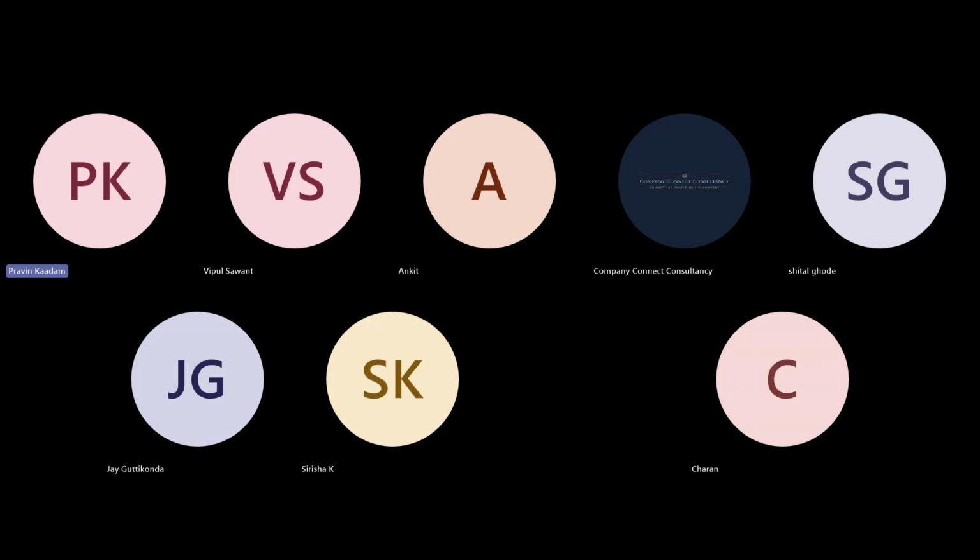Yes, very good question. If you have two different application servers, the exe path has to be the same. If it is E drive on the first server, it has to be E drive on the second server. All the prerequisites should be present on the second server, and the setup which we run today also needs to be executed on that particular server.